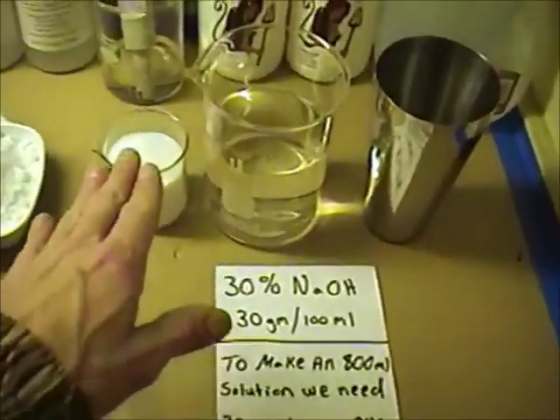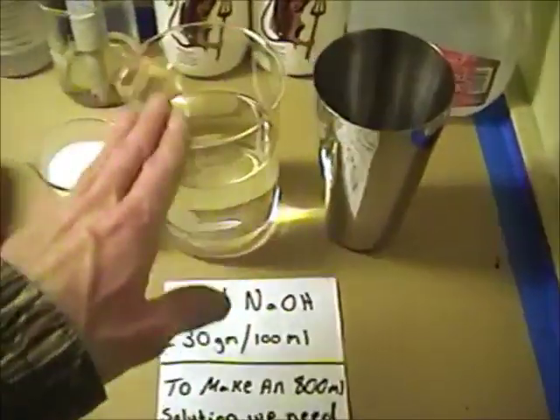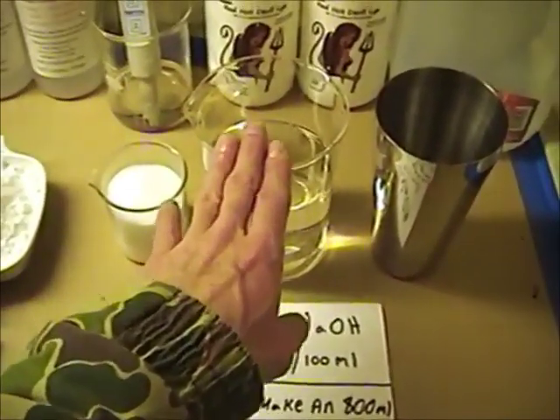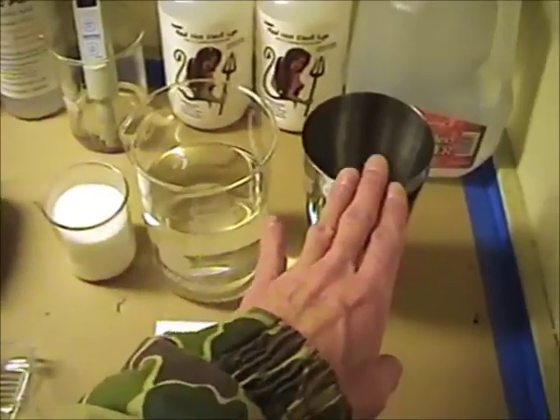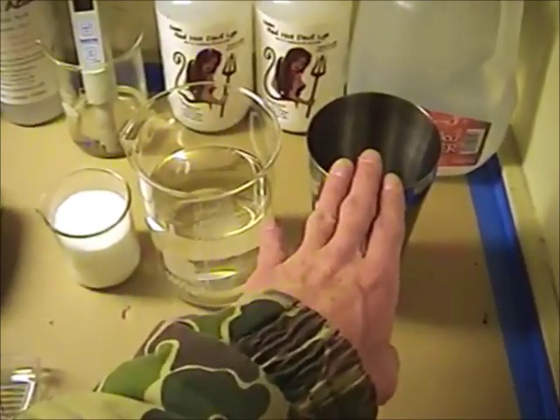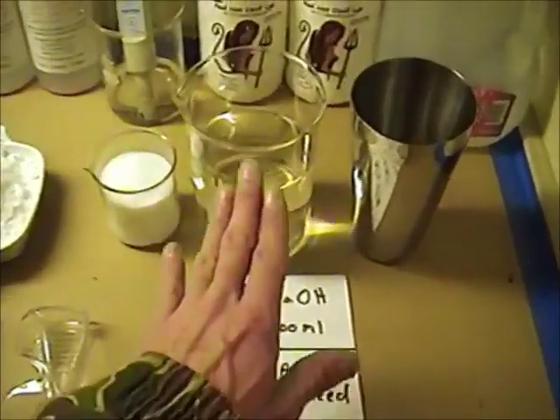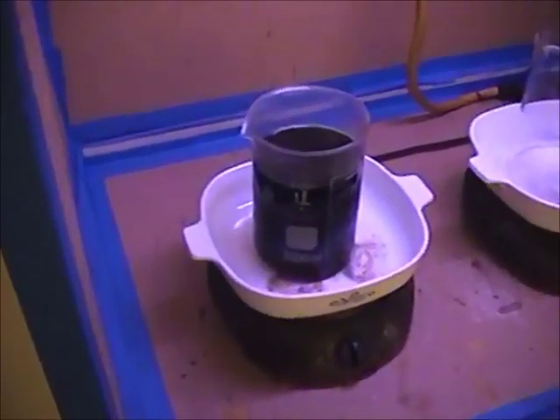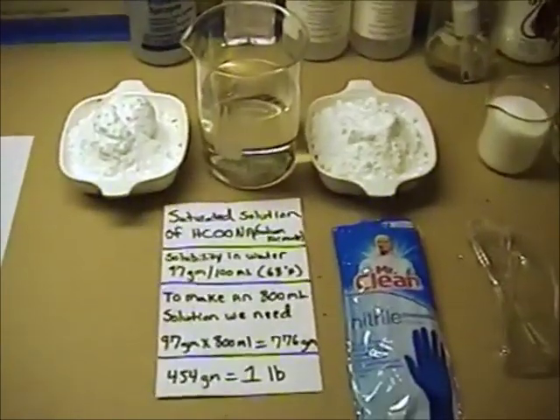Now, after I dissolve the sodium hydroxide into this solution and it cools off, I could put it back in my glass beaker. That won't be a problem. You just don't want to heat it at an elevated temperature because it will etch the glass and eat the glass. So once we've dissolved all of our sodium hydroxide and added it back to a glass beaker, then we can measure it out and add it to our silver nitrate solution over here to start precipitating everything as oxides. So, I'm going to cut away now and get everything set up.